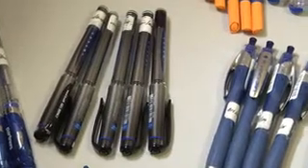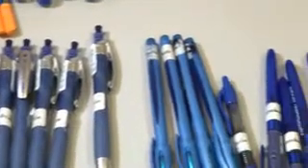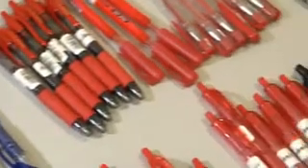As part of my work here at the university, I have analysed ink from over 400 different gel pens of different brands and models, and using different Raman spectrometers. I am testing the different instruments to see which one gives the best results. The results have allowed me to place different brands of gel pen into groups based on a comparison of their spectra by eye. This information provides the forensic scientist with an idea of how common a particular ink is, as well as how useful the technique of Raman spectroscopy is for telling different brands of gel ink apart.